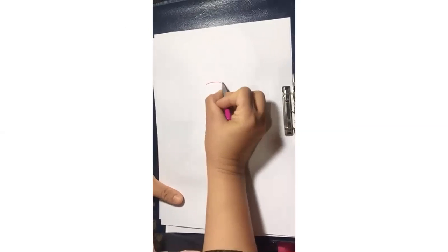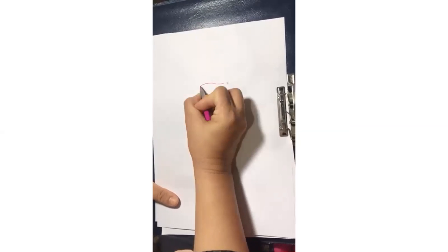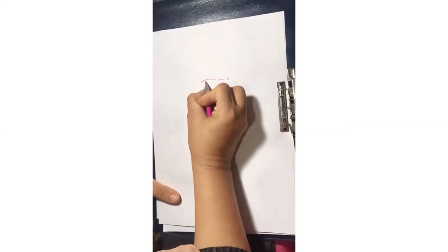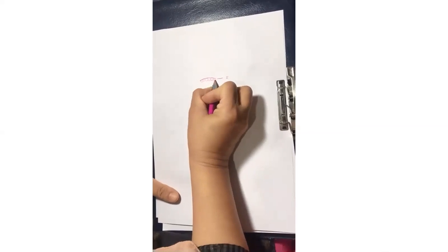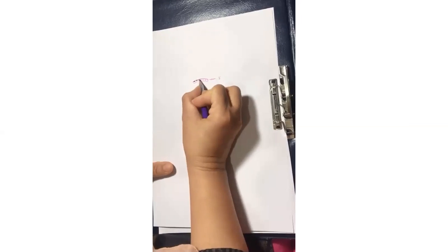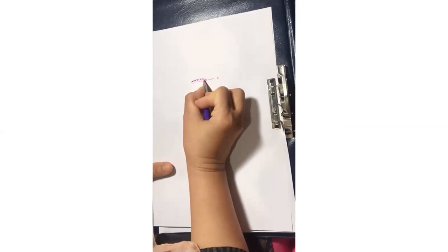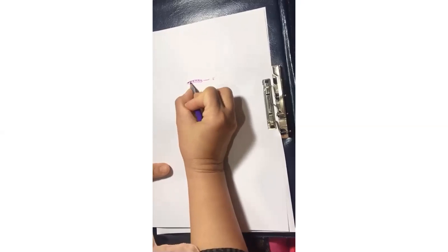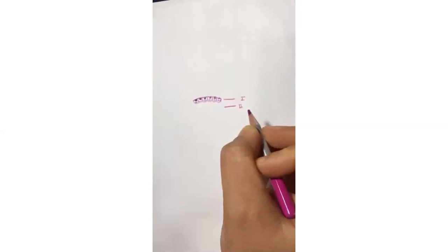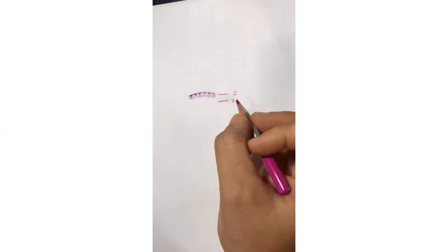First layer is the layer of pigment epithelium. It lies on the basement membrane. Pigment epithelium is low columnar cells with basal nuclei and apical brownish black pigment. Second layer is the layer of rods and cones.